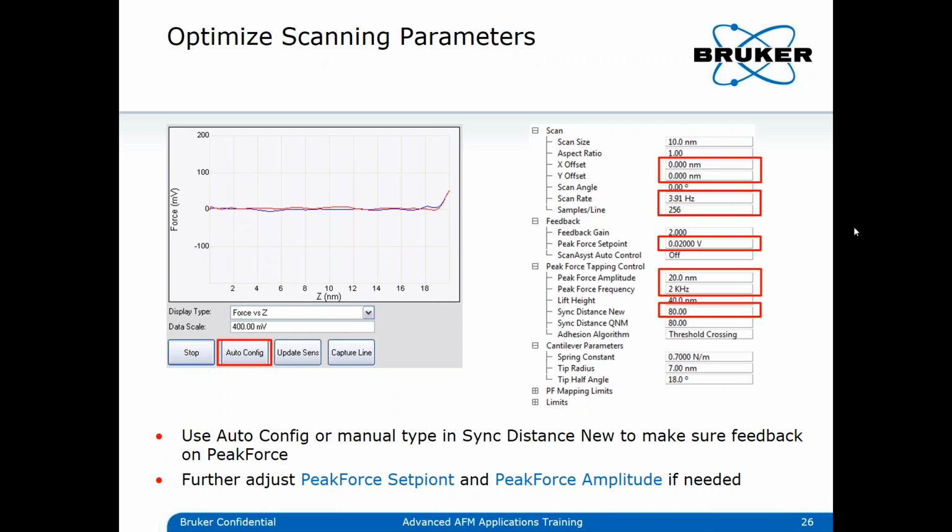Okay, so we'll wait for another few seconds to see if there are other questions. Oh, so as Isabel asked, will a 5-micron scanner work? A 5-micron scanner will work. I think 5-micron is most probably then the Innova system. Isabel, is this correct? Yes, that's correct. Okay, yeah, this will work.